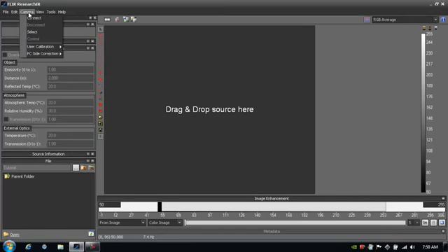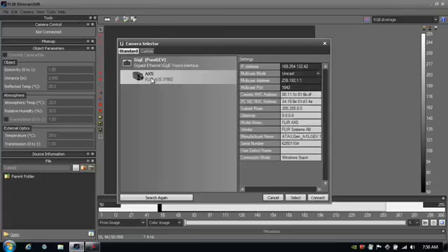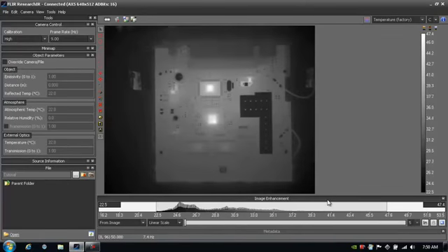I simply go to Camera, Select, and it finds all the infrared cameras from FLIR that are currently connected to my computer. In this case, the A65SC, which is part of the A65SC thermal benchtop test kit. I just select the camera and then click Connect. In a few moments, I'll get a nice, beautiful IR image that shows up. There we go. Anywhere I move my cursor, I can get a temperature value per pixel.